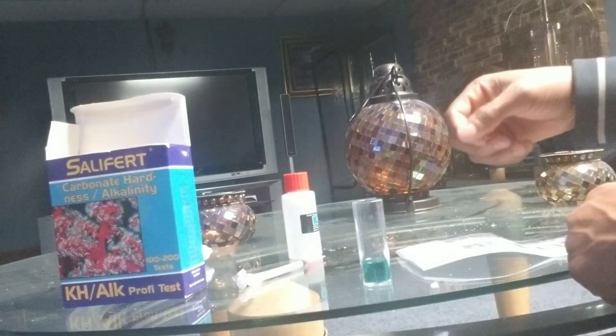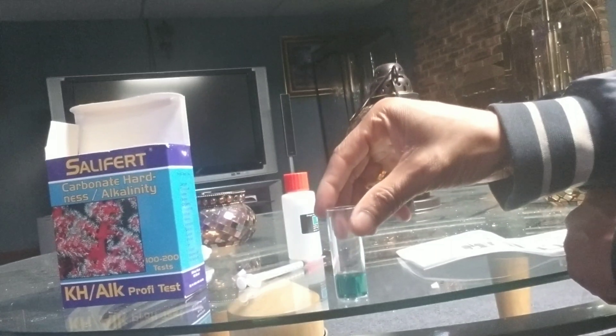After the four drops, you want to swirl the vial for five seconds.